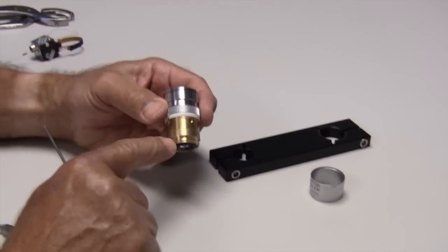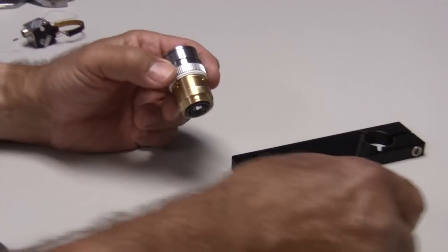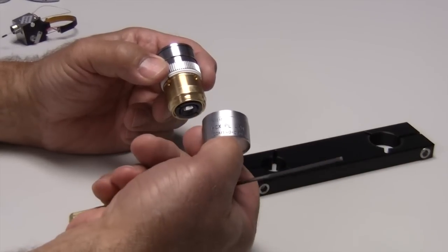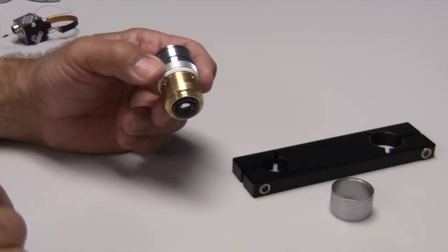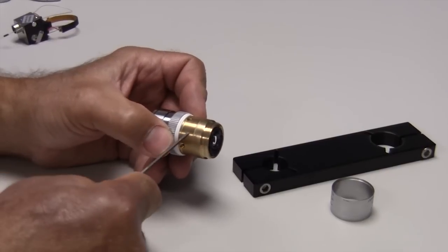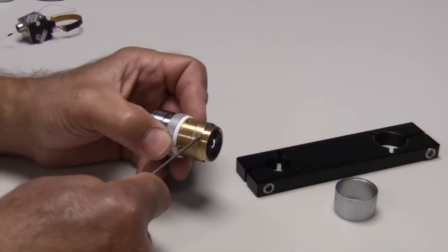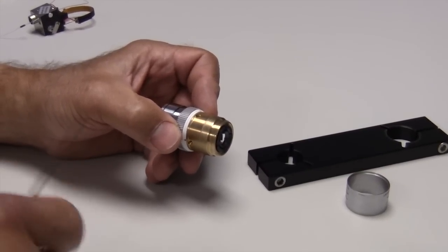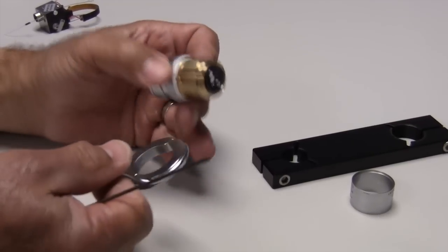Here we have a Leica 100X objective that has had the sleeve removed from the bottom of it that has the writing on it. This is to allow direct thermal contact with the base of the objective. You'll notice a little raised area right here, and that is where we need to apply the bioptics cooling ring.